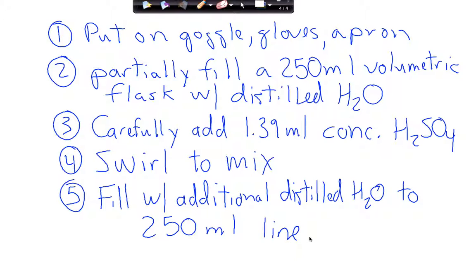Okay, so imagine this. If this is water, and I know 1.39 milliliters, not much, right? But what if you needed more? If you were dumping the acid into water and this boiled, what is mostly going to be coming out of the schnozzle is going to be water. Because as you dump this in, it's mostly water. You've added a little bit of acid, and if it goes, most of what's coming out will be water.